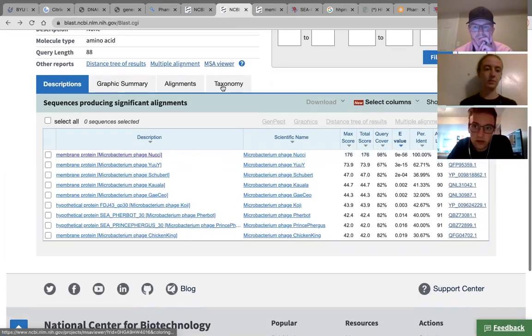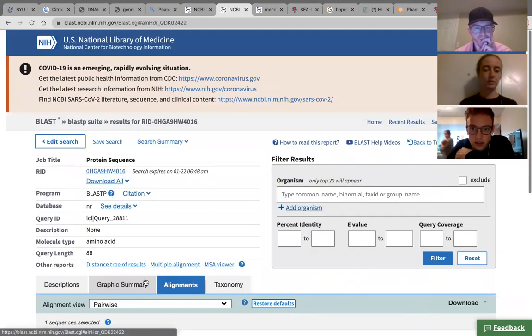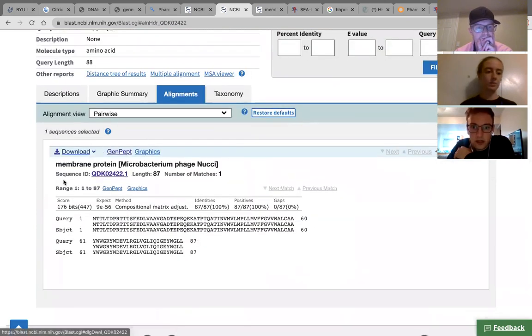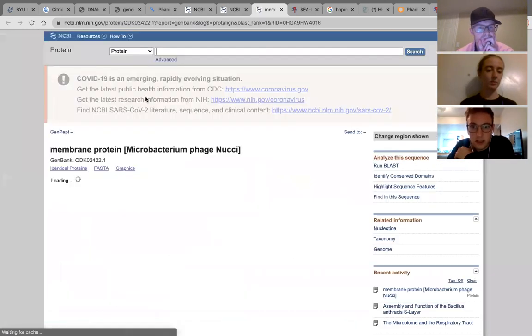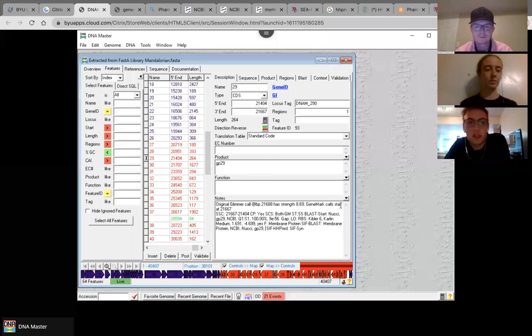If we go to the website and click on the phage, we can find it in 2 places. Yeah, that's the easiest one. It's the sequence ID. If you go in specifically, you'll see it. It's some kind of code. That's the accession number, that's what we're going to put down.